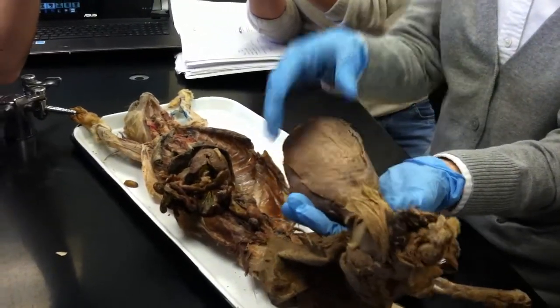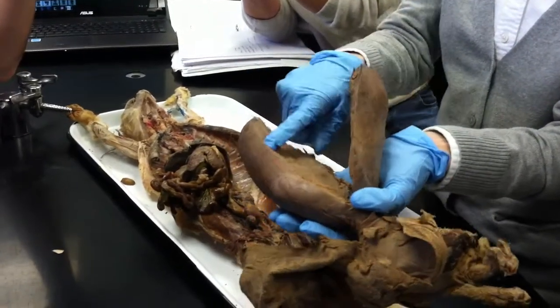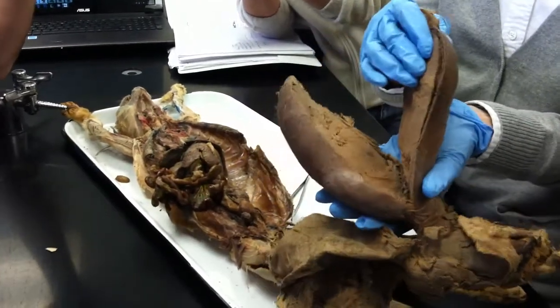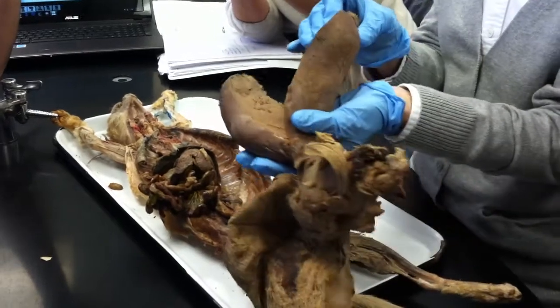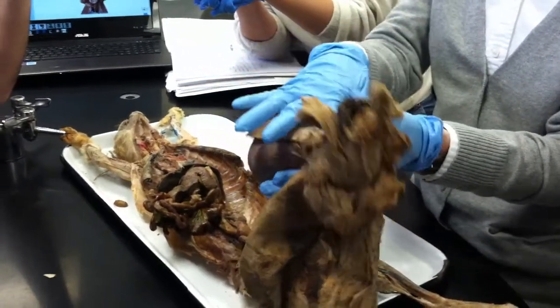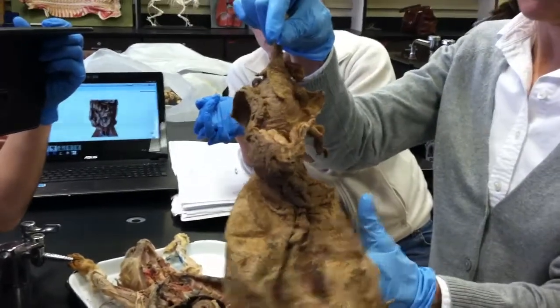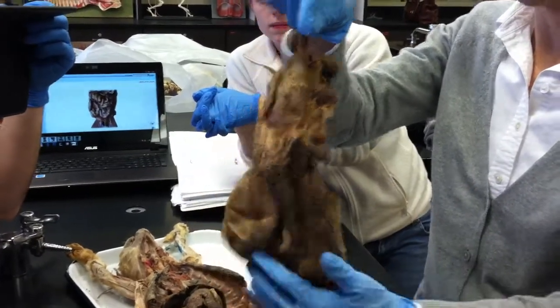That all leads up into the spermatic cord. And this dense material in here, this is all the seminiferous tubules where the sperm is actually produced. You can't really see those unless you have a microscope. So the sperm is produced here. It's sent through the epididymis up the spermatic cord and on its way. Good? Okay.